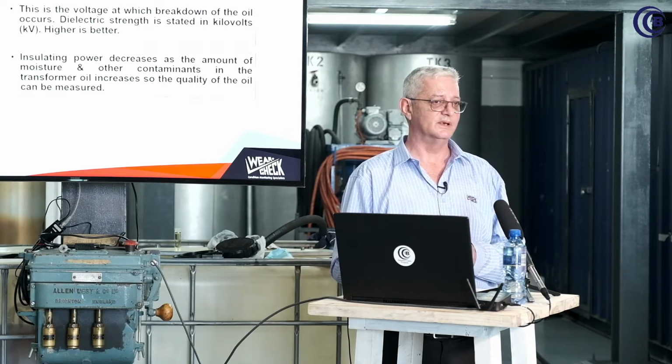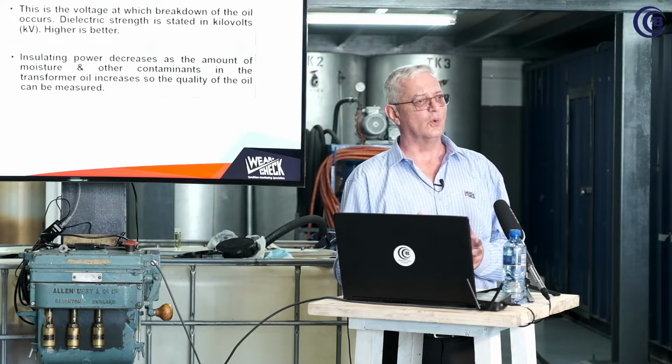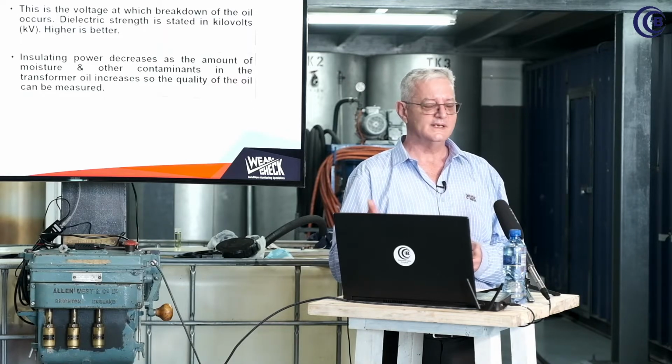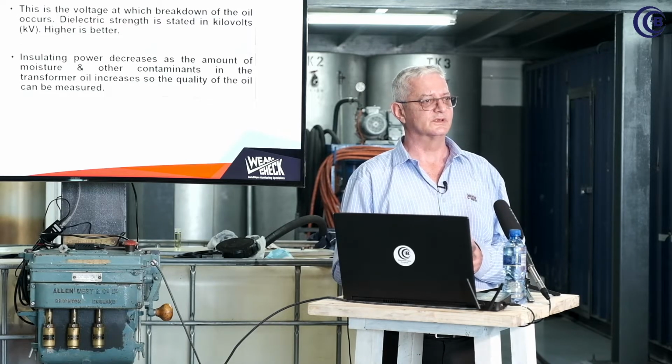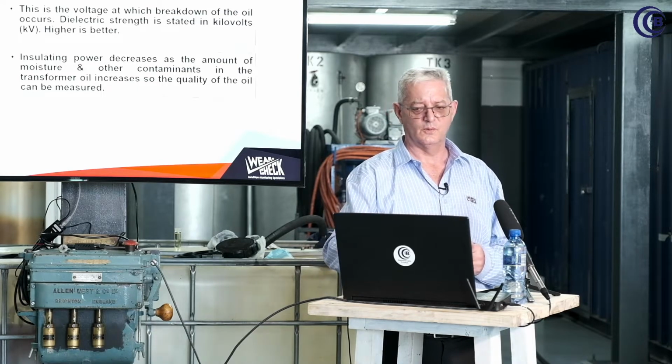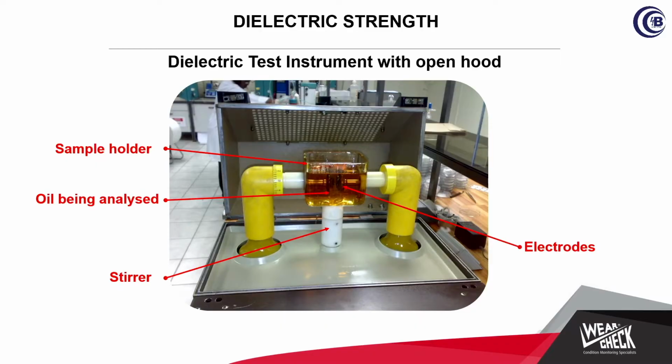There can be particles in your oil, either dust particles or even small paper particles, which are not always visible to the eye, that can influence your dielectric strength. But if this is too low, you can have a flashover in your transformer. So this is also to extend the lifespan of your oil, as well as of your transformer. The next two pictures will show you how this is done. This is the test where we use the most oil. That is why we standardized on a 1 liter tin. The vessel there takes 400 milliliters of oil alone, and you still need to clean that vessel.